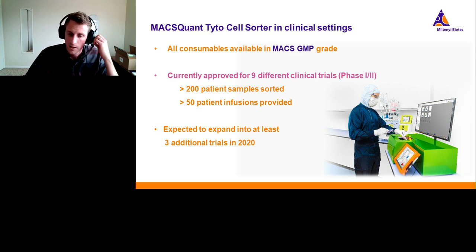And so to be able to get into the regulatory discussion of whether this product is clean enough, sterile enough to go back into a patient, there's an extensive amount of qualification that has to go into that.